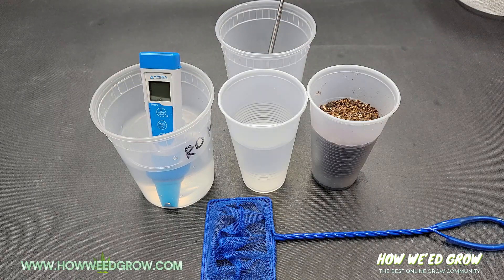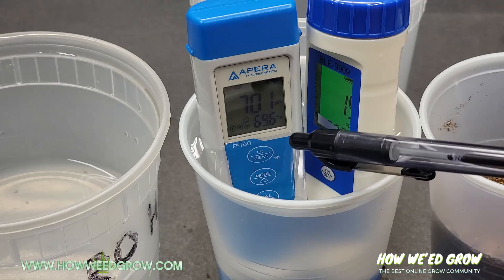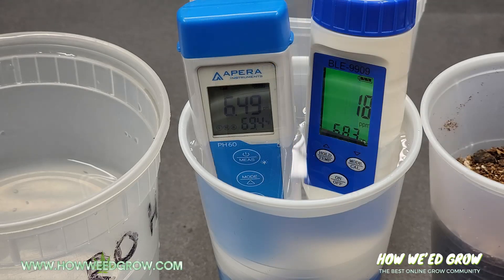Before you begin, measure the beginning pH and PPM of the water. I modified my initial pH to a neutral 7, but ideally you want to start with a comfortable pH for your plants, such as 6.5, to know exactly how pH changes in the soil.